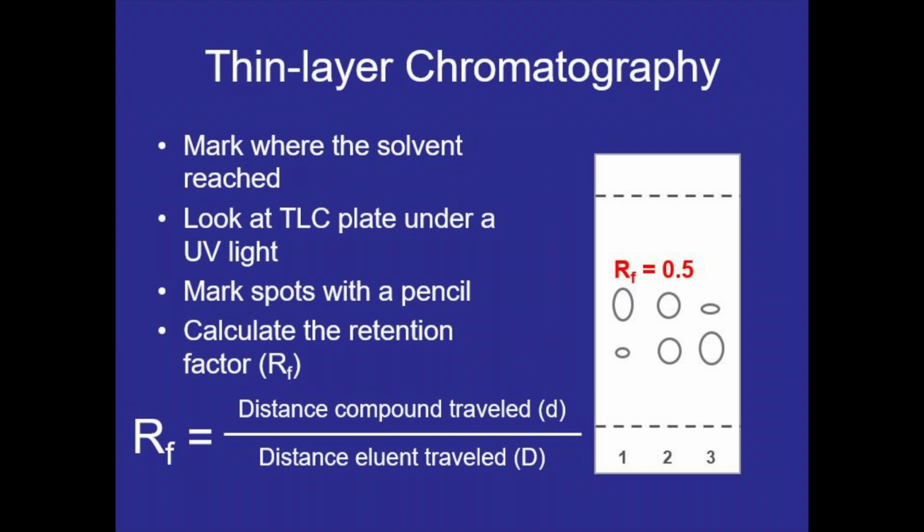And we're just going to eyeball this. We don't necessarily need to get a ruler out and measure all of the distances because the retention factor isn't standard. It can drastically change depending on the eluent used.